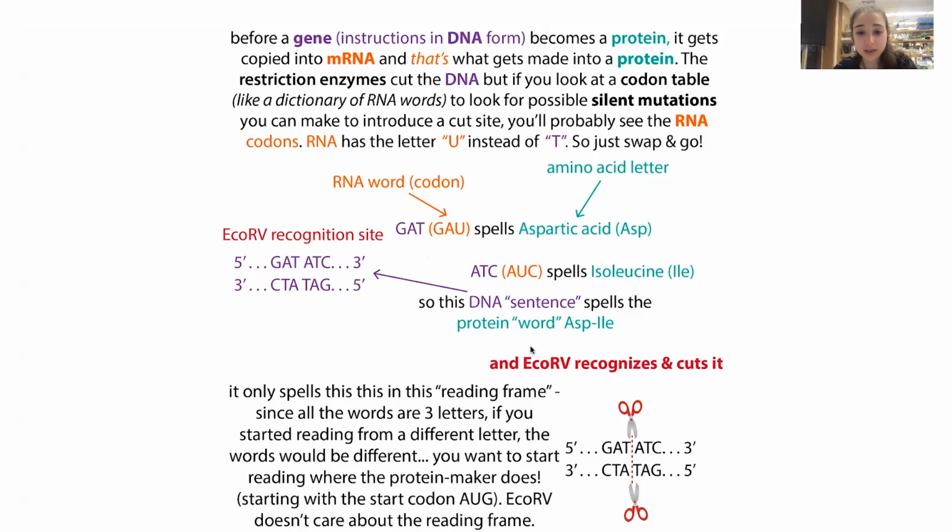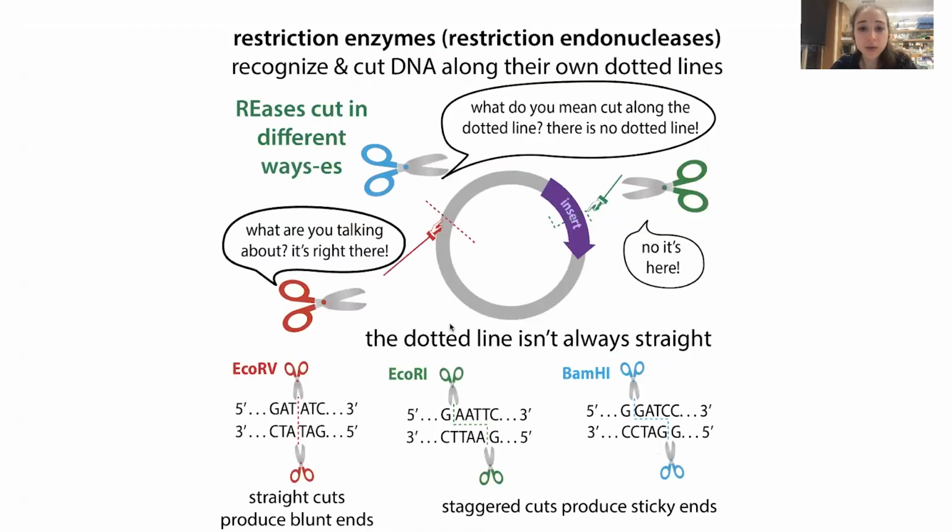You can change the sequence in a way that's not going to change the protein, introduce the silent site, but you can actually remove a site, because sometimes if you imagine that when you're doing this, you want to make sure that you only have a single cut site if your goal is cloning, or you have a cut site on either side for the same enzyme. But you need to make sure that you're not having cut sites where you don't want them.